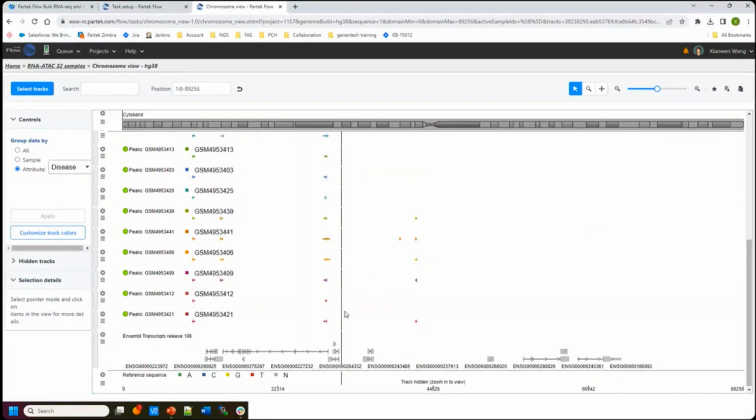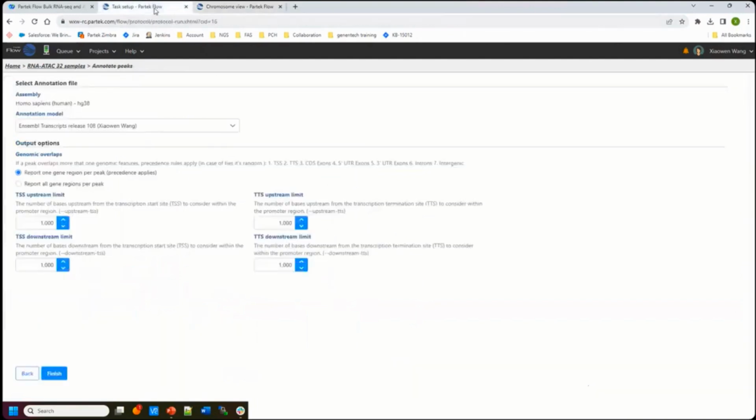So some genes might have 17 different transcripts. They all have the same start and stop, maybe one transcript skips an exon or something like that, right? So when you see a region overlap with a transcript, you might have multiple, maybe overlap with this transcript's exonic region, and the other one is an intronic region, right?